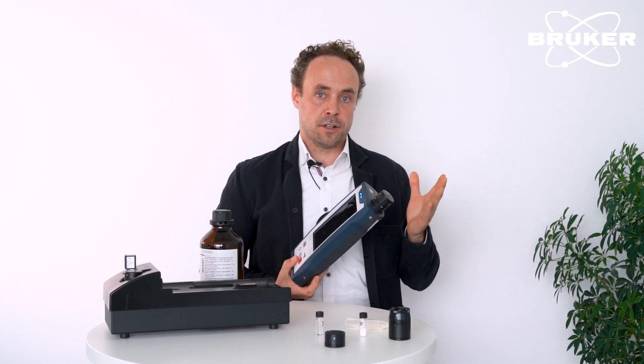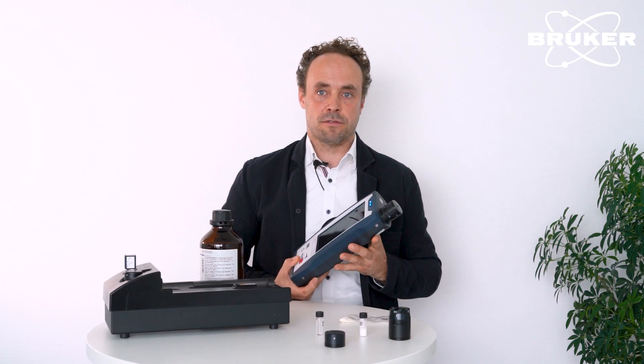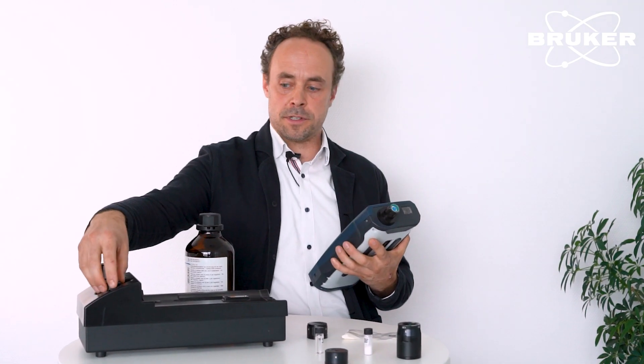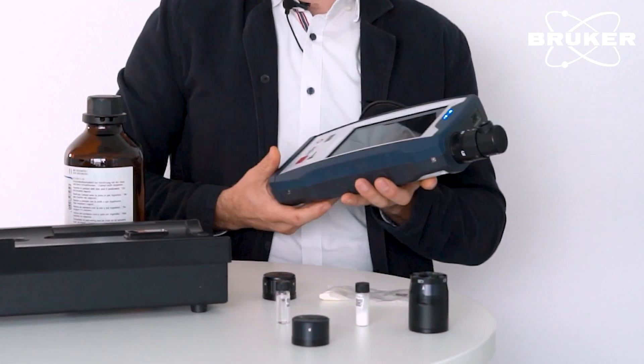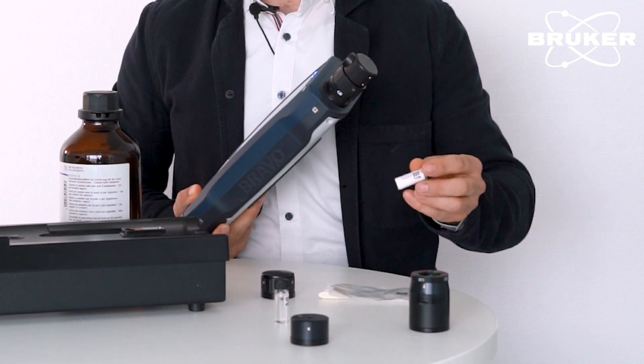A handheld Raman spectrometer can be employed very versatilely. Measurements are not only possible through transparent or semi-transparent packaging foils. We can also exchange the measurement adapters — for example, here is a tip for measurements in small four milliliter vials. Of course, we can customize adaptations as well.